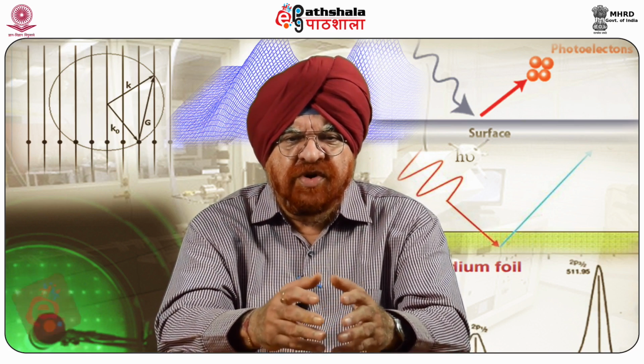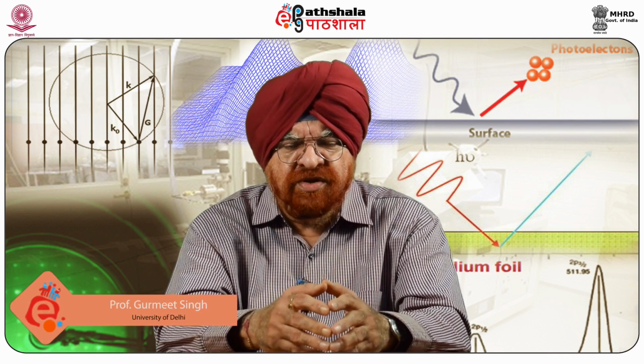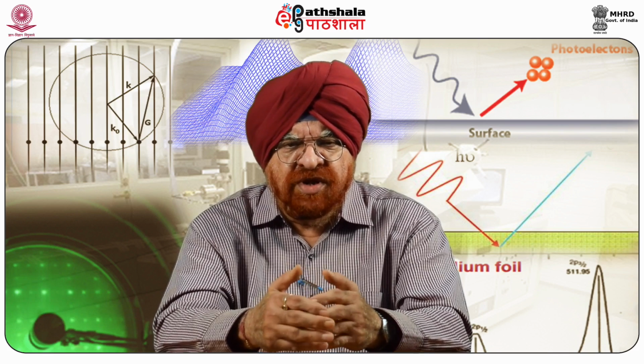The tip is placed close to the sample surface, from some nanometers to a few micrometers, and interacts with the stray field emanating from the sample. The image is formed by scanning the tip laterally with respect to the sample and measuring the force or force gradient as a function of position. The interaction strength is then determined by monitoring the motion of the cantilever using a sensor. Although a lot of effort has been made to get quantitative information, magnetic force microscopy is still predominantly a qualitative characterization technique. I am sure you would have understood the importance of this MFM technique when we carry out the analysis of surfaces.